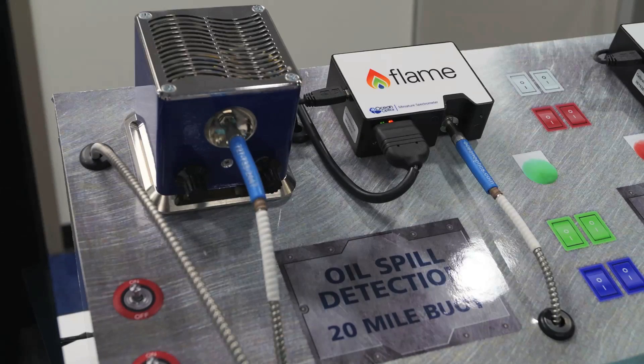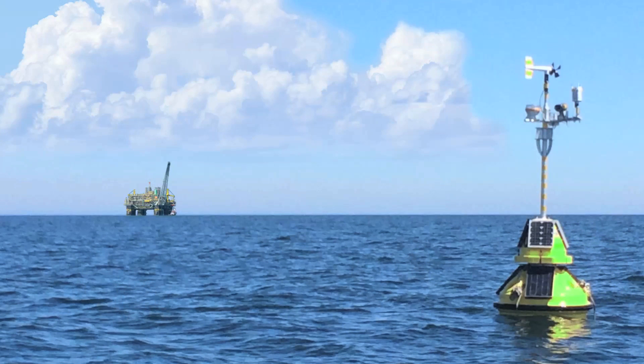Modular spectroscopy is great for this type of application because the small size and low power draw enables them to be used in remote monitoring stations.